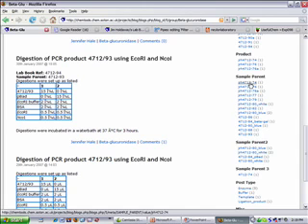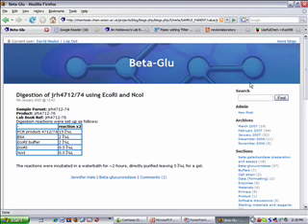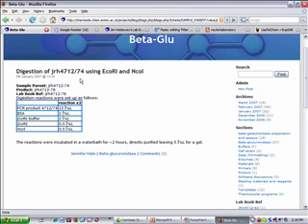So if I click on this and go through to that particular post, we have a procedure here. This happens to be a restriction digestion of a piece of DNA. And you can see this is the lab book reference where she's done this, and this is a reference, it happens to be on the same page for some reason, of her paper lab book where she made the material that went in.